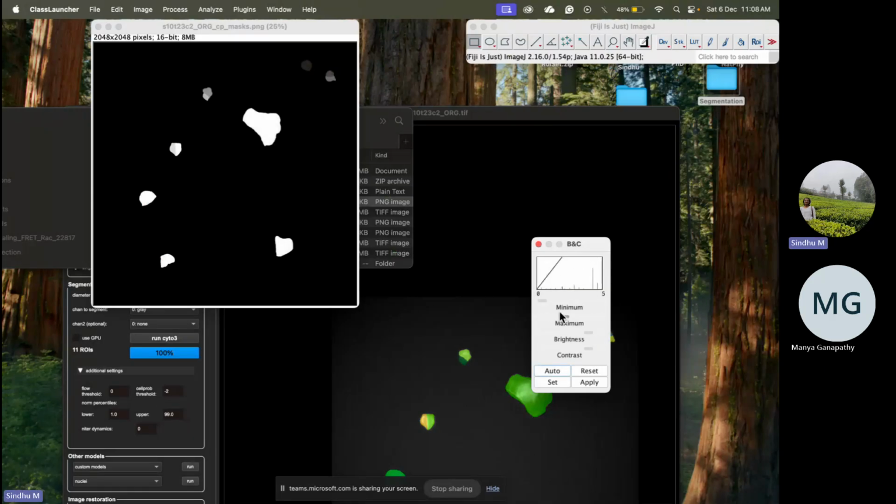And then if I oversaturate it, so earlier this is like an instance segmentation because it has differentiated the cells from the background, and it has also differentiated between the cells. But now if I oversaturate it, then all the cells get a value of 1, so it becomes a grayscale image essentially, where 0 pixels represent the background and all the 1 pixels represent the cells.